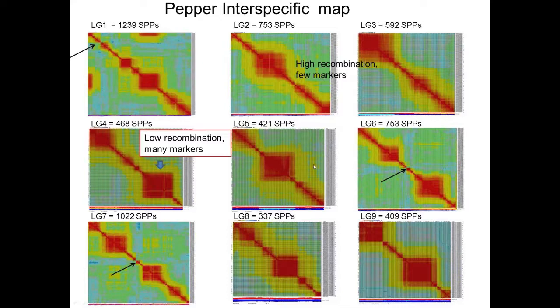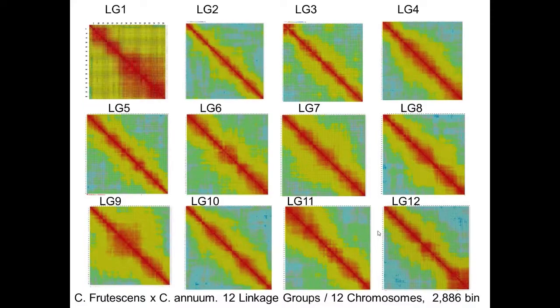And we found basically 3 areas where there were some logical breakpoints, where we have these really fine areas of basically repulsion. You see these blues all over the place. So this was first the P1, P8 translocation. And there were 2 areas right here also in linkage group 6 and linkage group 7. You see this repulsion saying, you know what, the markers over here are really not happy with the guys down here. And so we broke those linkage groups, we refined our map, and this is what we get.